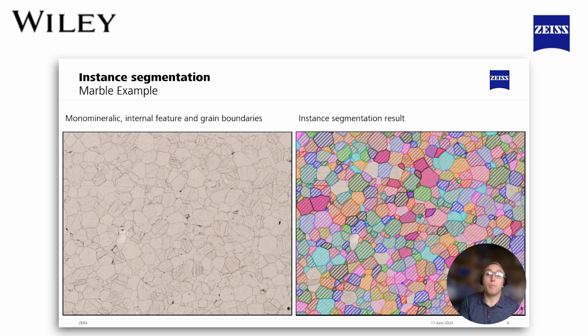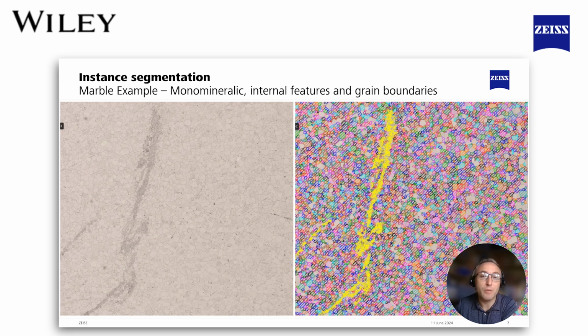And so this is not about perfection. That's not the way deep learning models work, but it's being able to gain more information, more statistically representative information than we have before. If we get hundreds or even thousands of grains and miss 5 or 10 or 20 of them, then that isn't really a huge loss in terms of the statistical representation of all the grain size distribution or information. And we can apply that then to a much larger image.